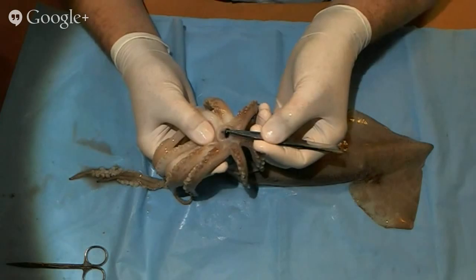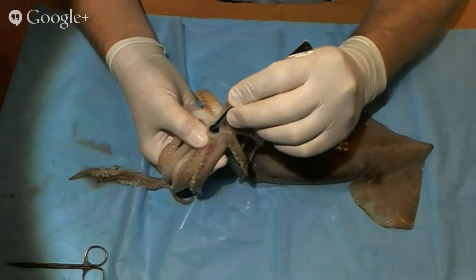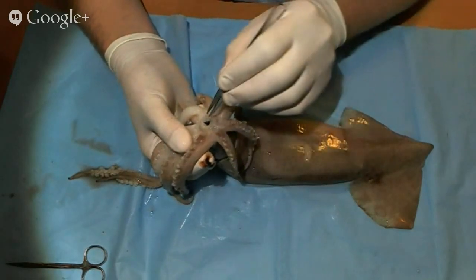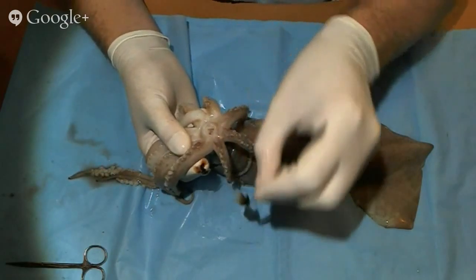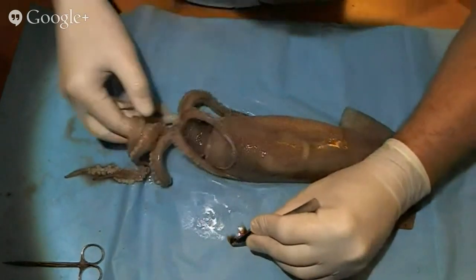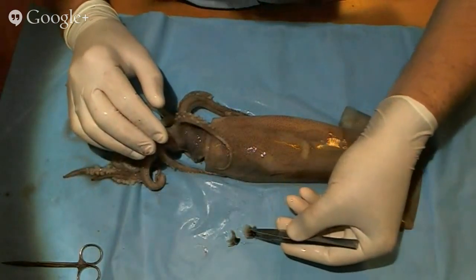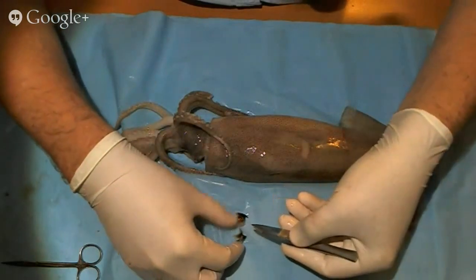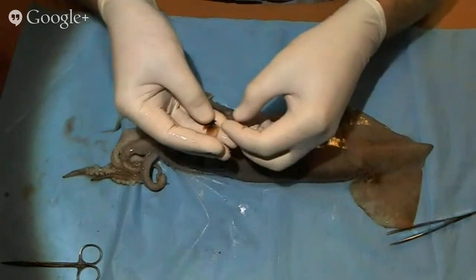And so if they do, they can reach inside and they can see that the squid actually has a beak. Now, a lot of kids already know this just because it's pretty prevalent in cartoons and media today. But there are two parts to the beak, and when you have them pull that out, it's usually pretty amazing for them to see that when the two pieces go together, and have them try and recreate and put it back together so they can see if they can hinge it themselves. It happens to be extra slippery right now.